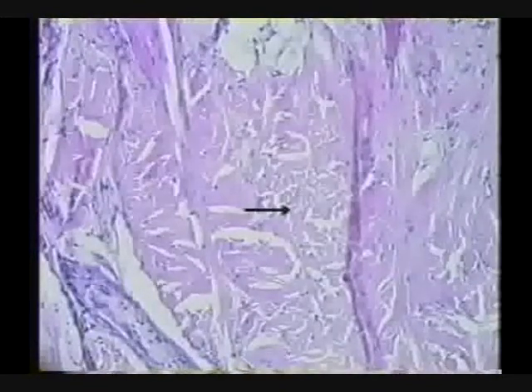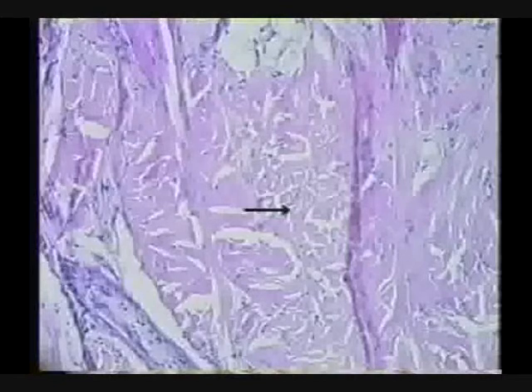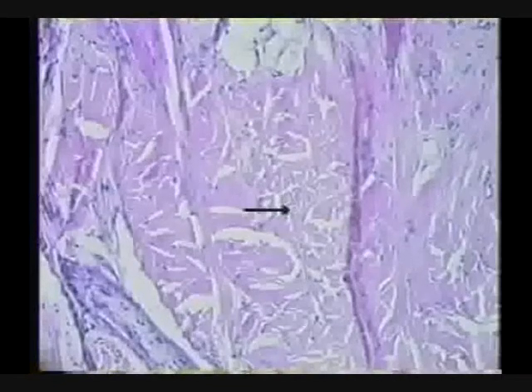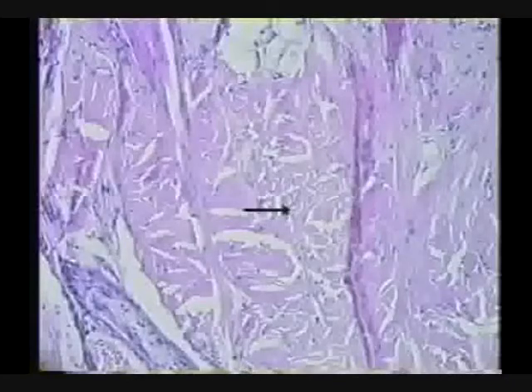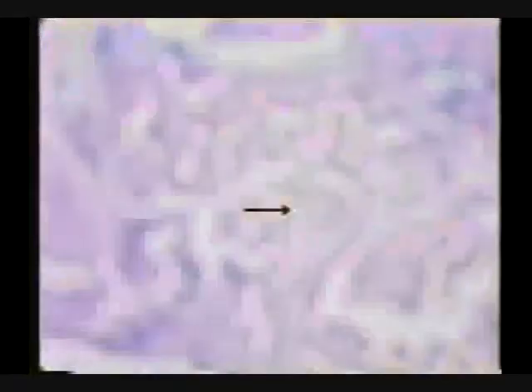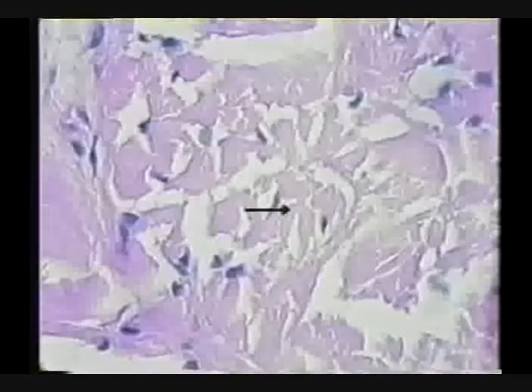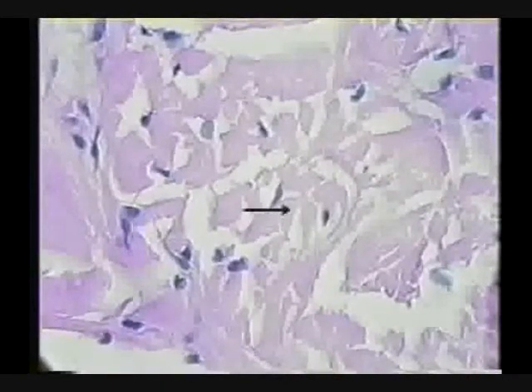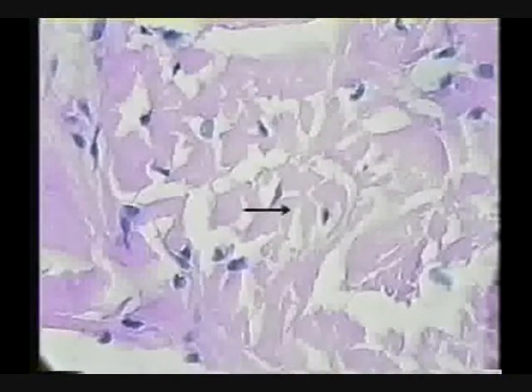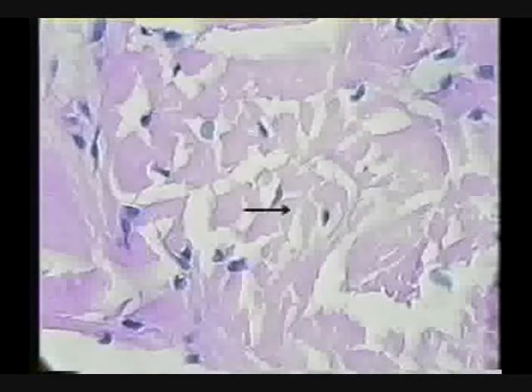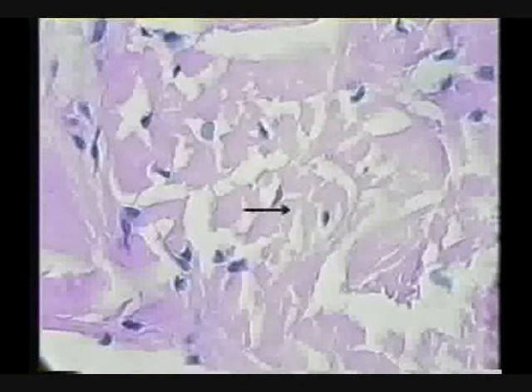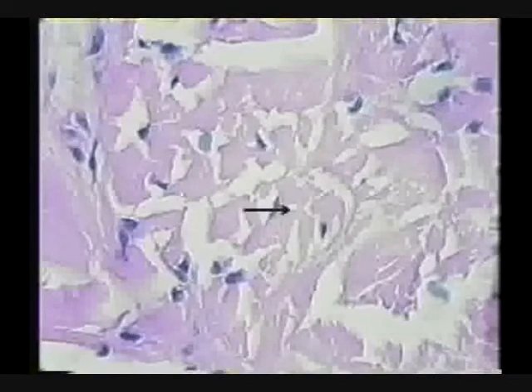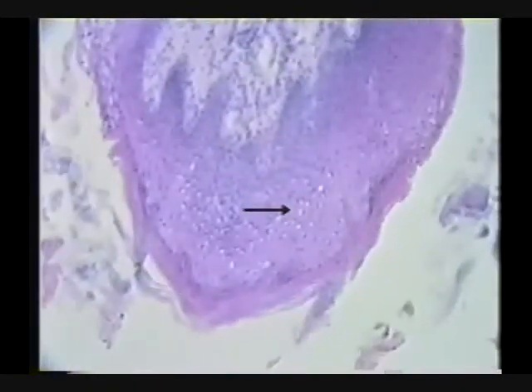Identify the tissue surrounding the pointer. What's it look like? Connective tissue. Why does it look like connective tissue? Because it is. Okay, what connective tissue does this look like? Dense white fibrous connective tissue, irregularly arranged. This is a good example of dense irregular connective tissue. Okay, just happened to run into it.